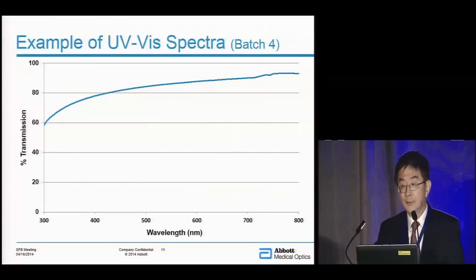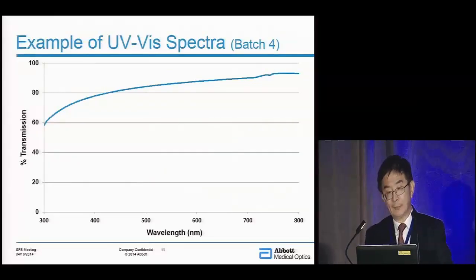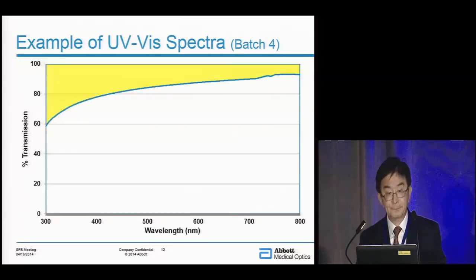This is a typical UV spectrum, as I mentioned, one of these non-purified. And then how did you say this is haze? The only thing you can say is 500 is roughly 82, 600 nanometer wave number is 85. So it's difficult to say, is this haze or is it not haze? So what are we reading from the definition?